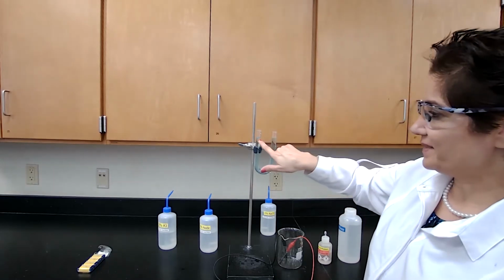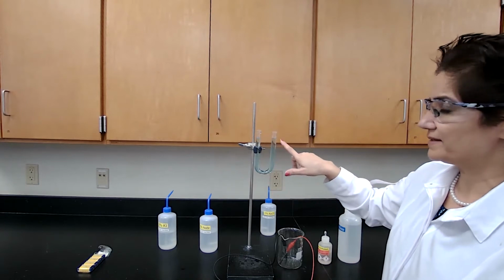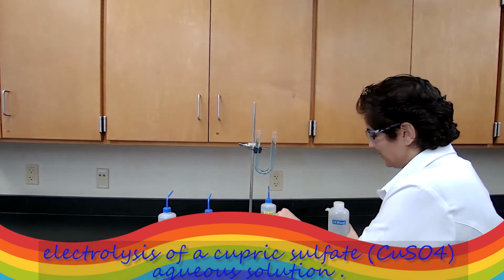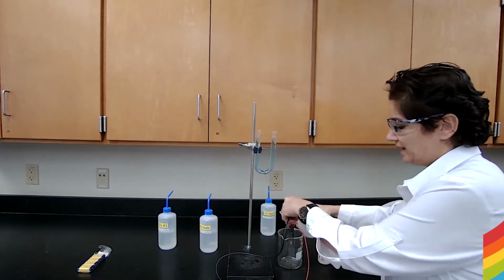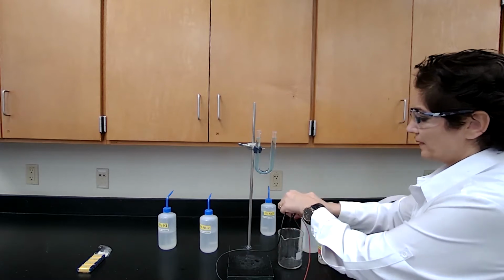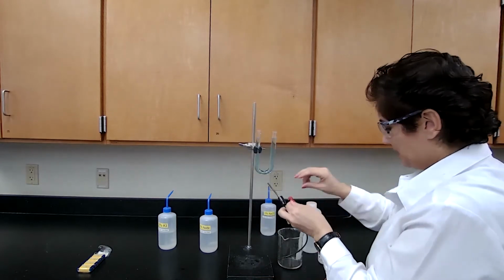Okay, now I have the cupric sulfate, copper 2 sulfate in the U-shaped glass tube. I did wash it, but I'm going to rinse the electrodes again because I don't want to carry the chemicals from one reaction to another one. And I place the electrodes in each arm.